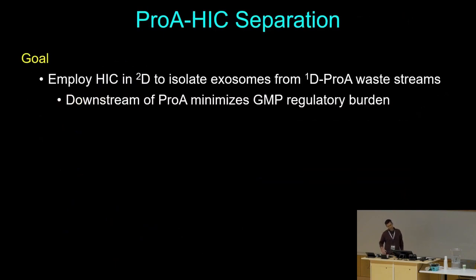And so we set out to develop a ProA HIC method that employs HIC in the 2D to isolate exosomes from 1D ProA waste streams.